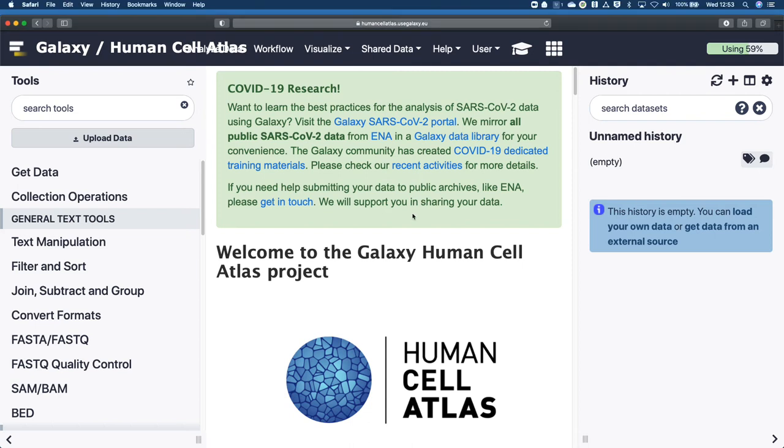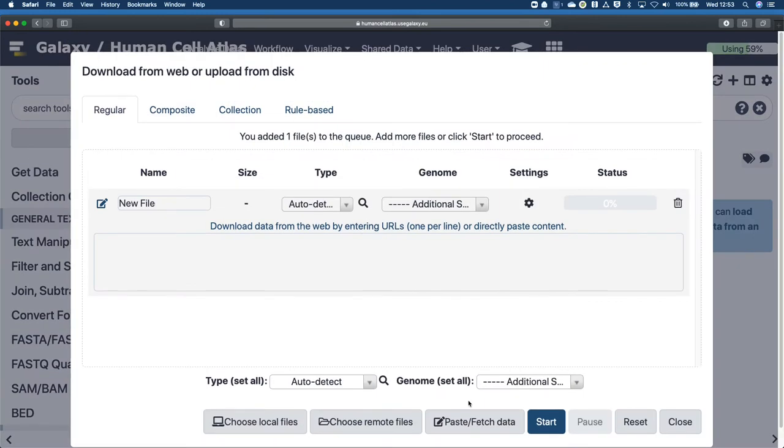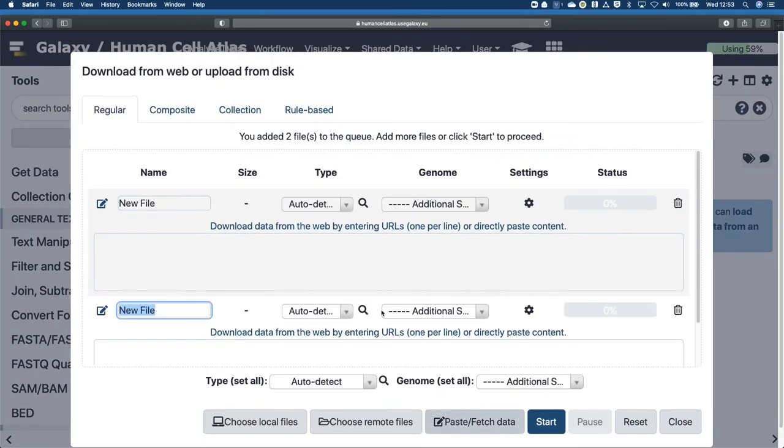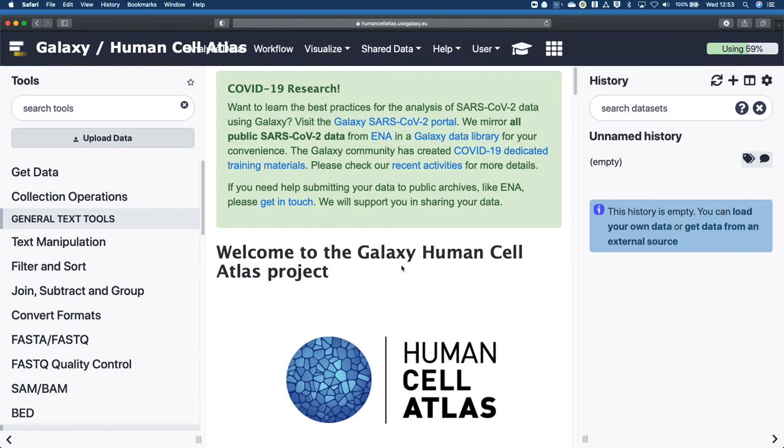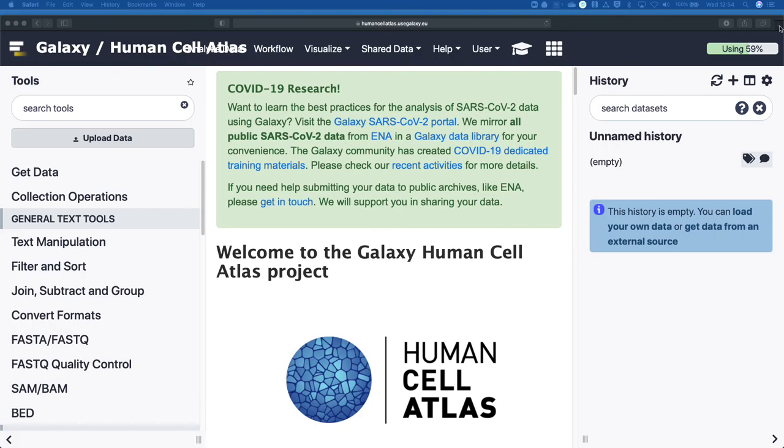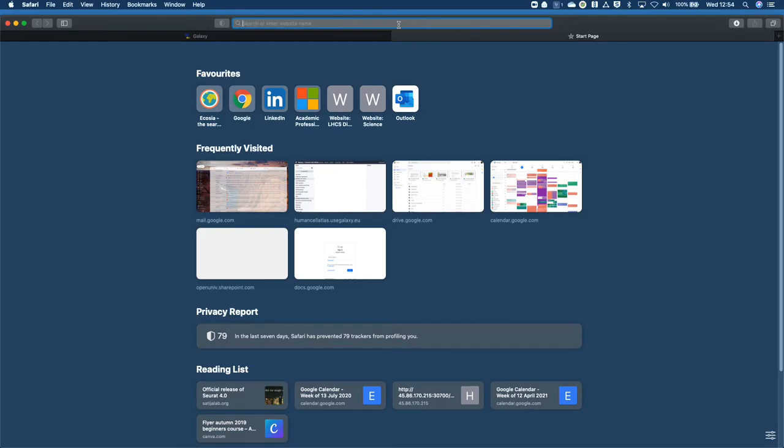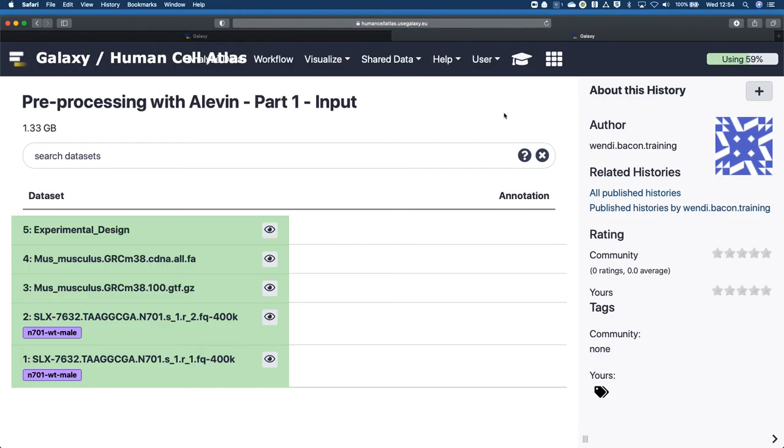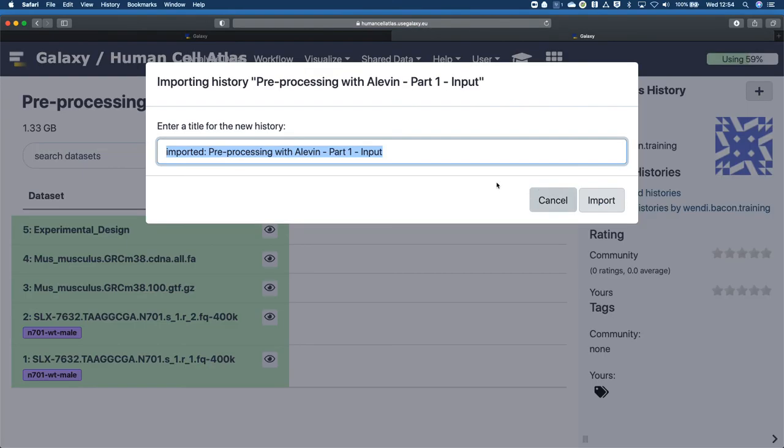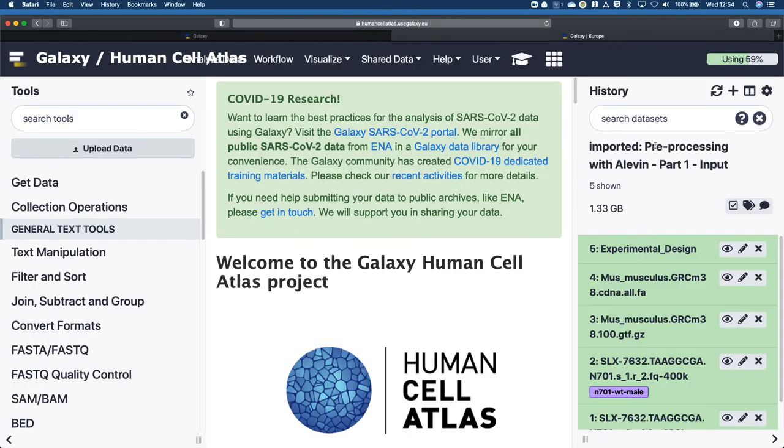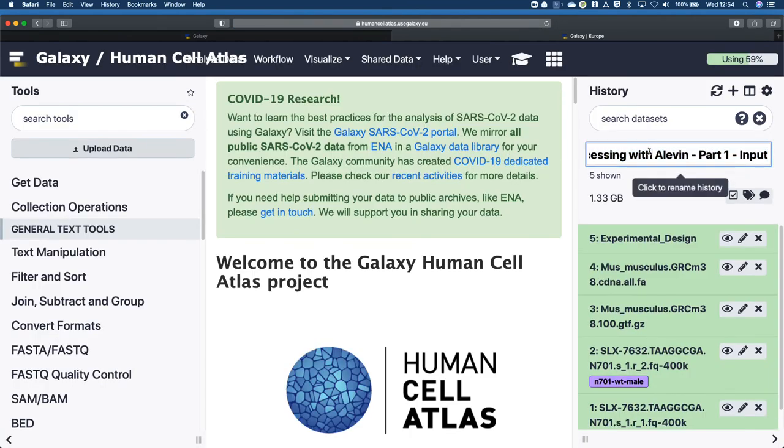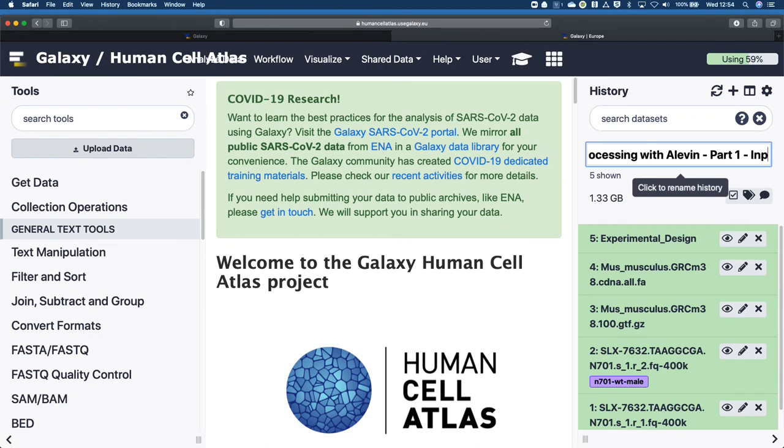Now normally at the beginning of a tutorial we do a load of getting data. We copy all the links to the data, come over here, go to paste fetch data, and we're able to paste our links in and then download it. With bigger files that can sometimes take a little while. So I quite like the little sneaky way. That's why I'll often when I make a tutorial also give an input history. So I'm going to nab my input history and I'm going to import that directly. Terrible data management there. You should probably make this something else. So it'll be part one tutorial. Let's go.